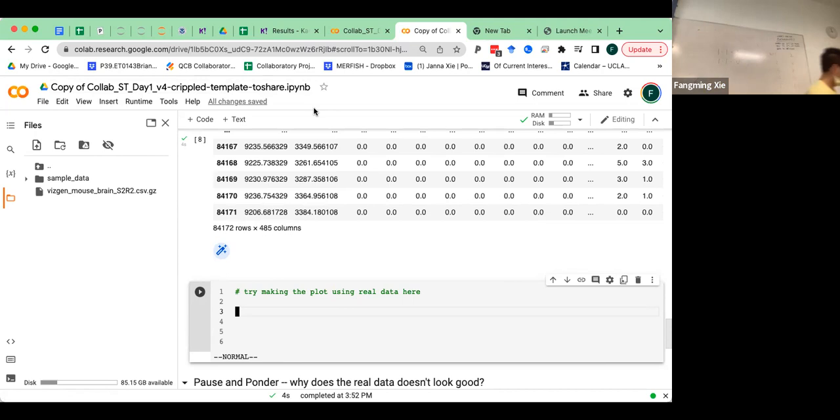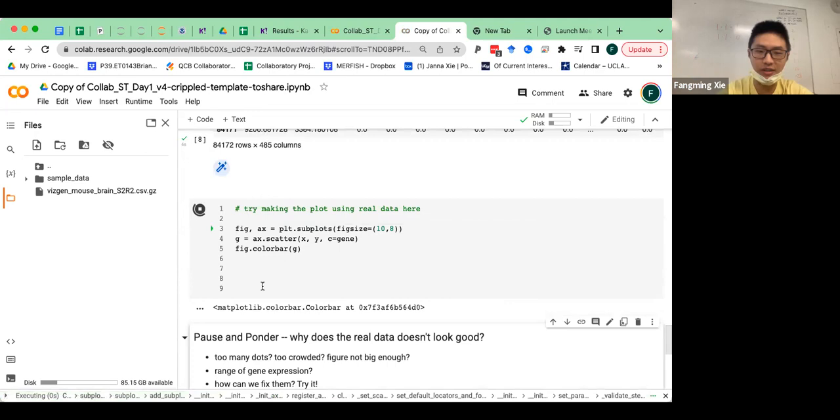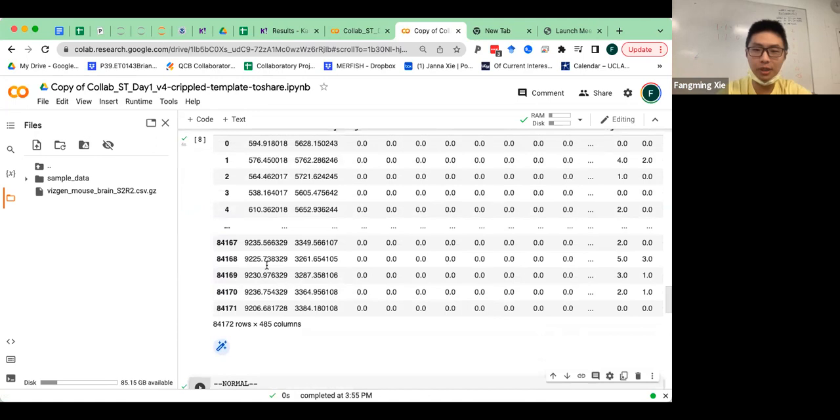Okay, let's get started. First of all, we made a plot in iteration 3 just on some simulated data, some random numbers we typed in. We just want to apply it to our real data. So we first copy everything from our successful example last time and rerun it down here. So we reproduced it. What's the big deal? Now we worry about how to collect the right data.